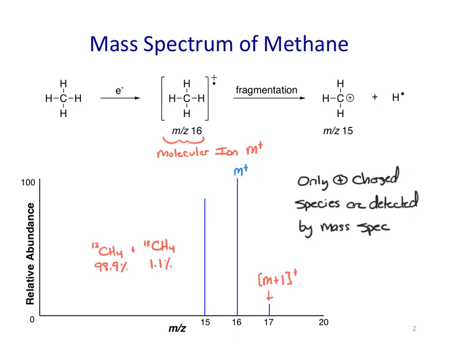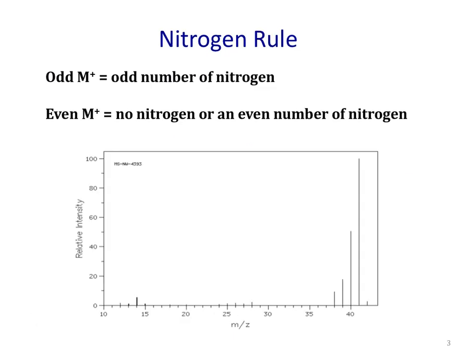All right, we're going to look at a few common atoms you can find in mass spec and some tips and tricks that we can use. First, here's this mass spectrum, and when you're analyzing it, your eye should really go to this rightmost grouping of peaks. That's where your molecular ion is going to exist. The tallest one in this group happens to be our molecular ion. This little one right here is the M+1.